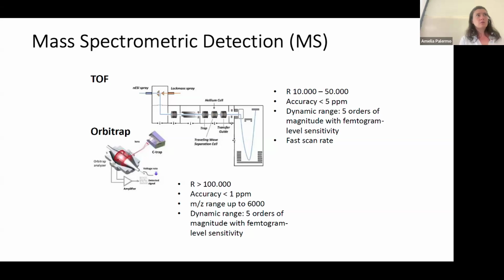I don't think so. Yeah, because it's a fixed slice of tissue, and I don't know exactly what it does, but it's like the laser capture. Okay, you use a laser for ionization. That's called MALDI, which is different than ESI. So it's a different source. It's more imaging. I can add more examples and information in the coming days about that.